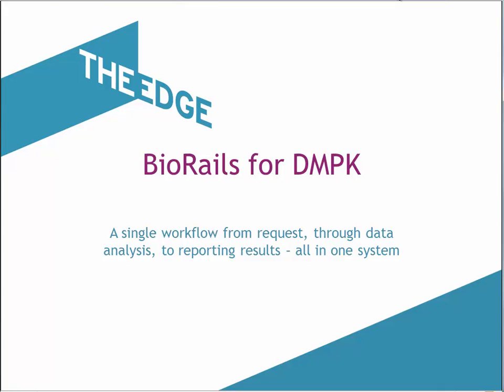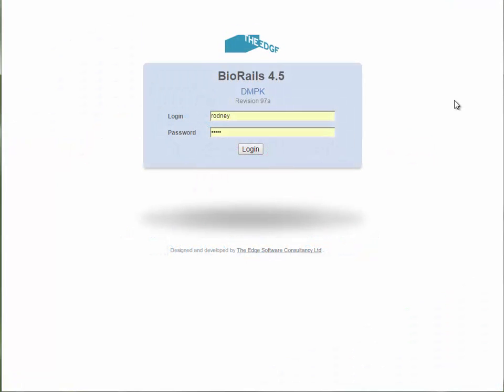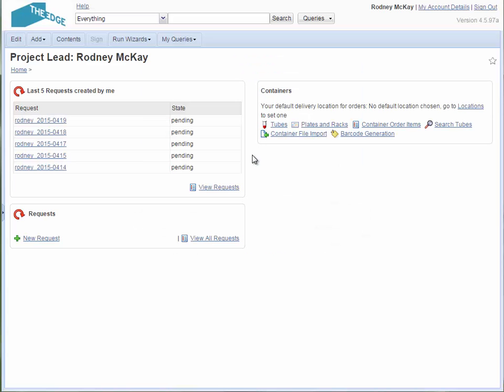Biorails for DMPK, a single workflow from request through data analysis to reporting results, all in one system. This is a cytochrome P450 inhibition assay carried out in Biorails. I am first logging in as Rodney McKay. He is the chemist responsible for requesting assays to be carried out against samples.